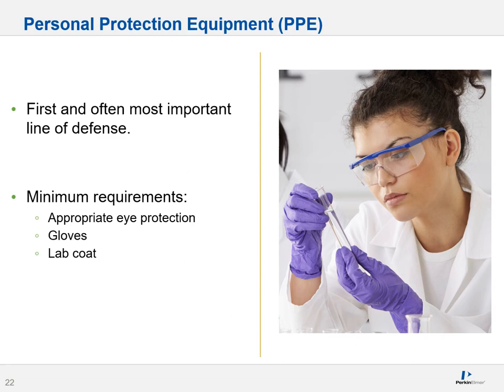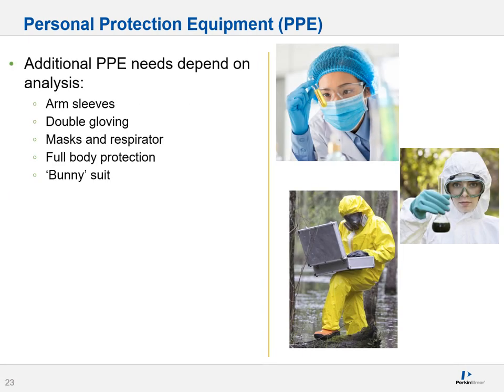Let's have a chat about personal protective equipment, also called PPE. This is often the first and most important line of defense. At very minimum levels, you need appropriate eye protection, appropriate gloves, and a lab coat as a base level of PPE. Additional PPE might be needed based on the type of analysis you're conducting, the type of instrumentation, or the types of samples you're working with. These guidelines are usually defined in the instrument methodology, sample preparation methodology, or protocols.